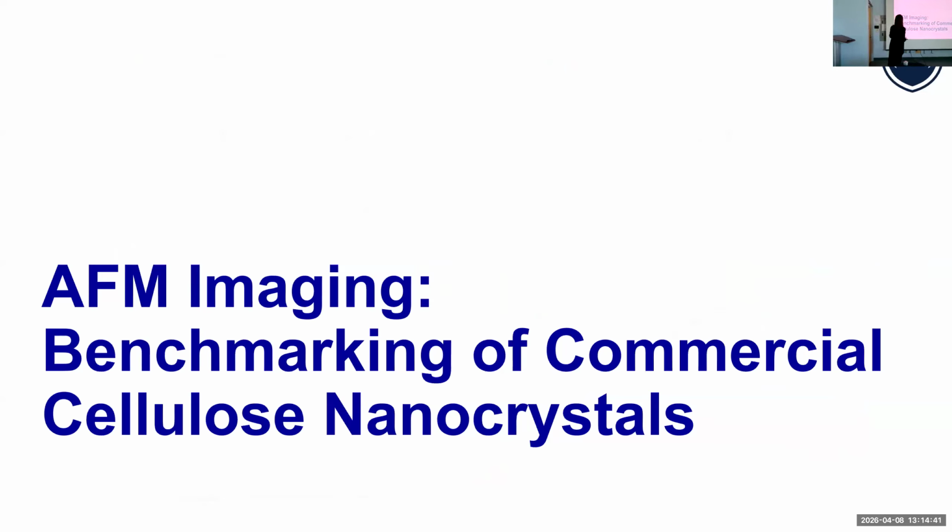So just to give one example of AFM imaging, because I know that's what most people are thinking of when they think of AFM, this was imaging that was really, really critical for industry. And so normally you think, oh, we want pretty pictures because it's great to see what we have. In this case, it was part of a benchmarking study where we were looking at commercially available cellulose nanocrystals and really trying to identify their similarities and differences.